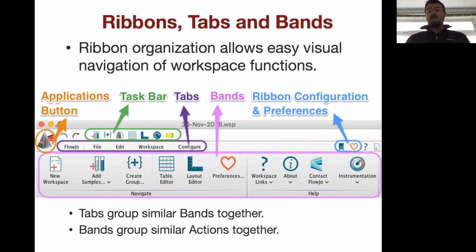The tabs contain different ribbons and bands within the workspace, and those bands are composed of different options that are similar.